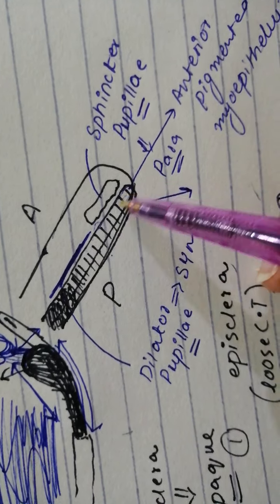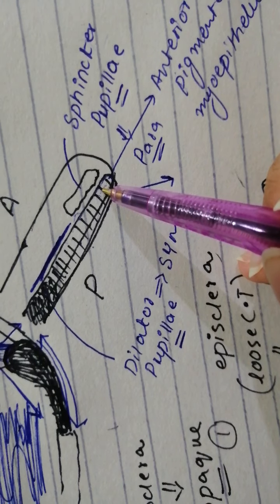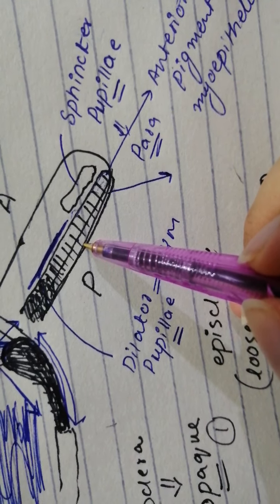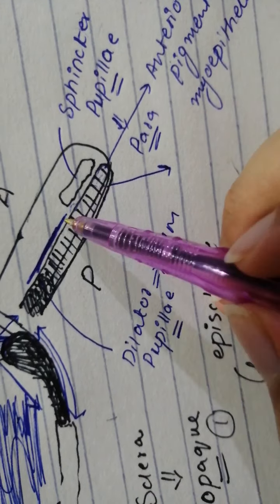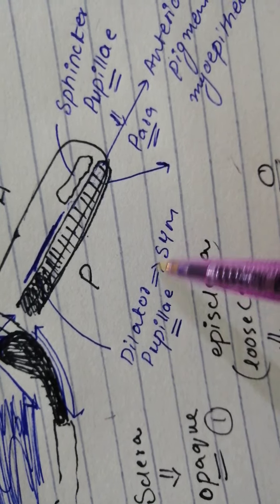So as I've said, both of the layers are pigmented and this is the anterior pigmented myoepithelium and this is the posterior pigmented epithelium. And the processes of the anterior pigmented myoepithelium, they are together collectively referred to as the dilator pupillae.